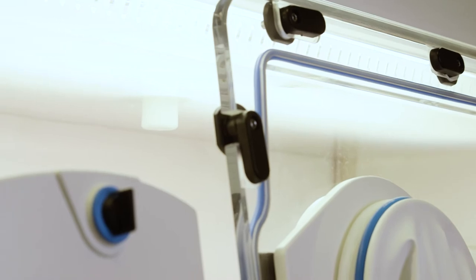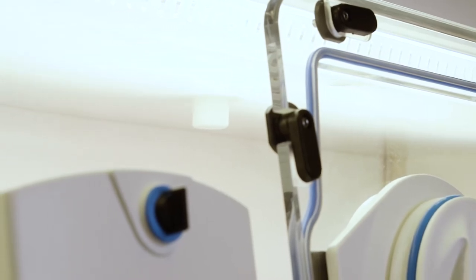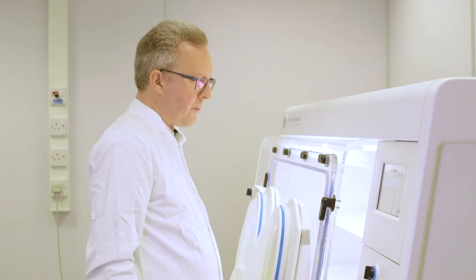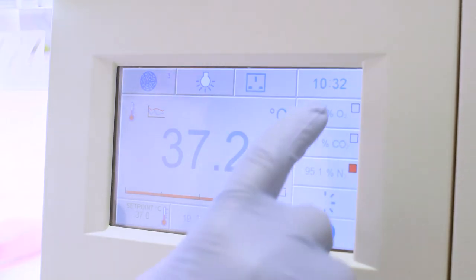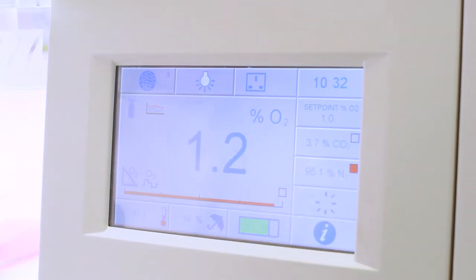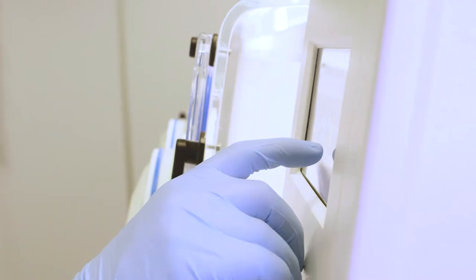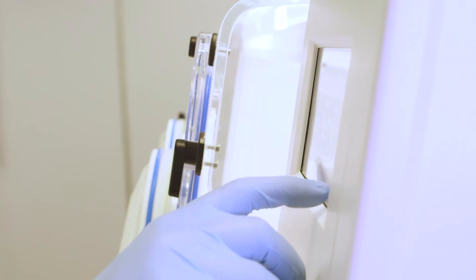Internal hypoxic station conditions are monitored with an oxygen sensor that is located within the chamber area providing real-time feedback and a quick response to maintain the desired physiological conditions. Daily gas usage is also monitored and recorded.